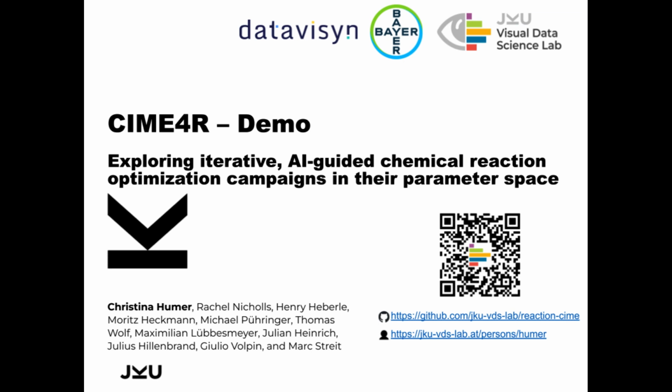This was a demo of how to use CIME4R and its features. The code is openly available on GitHub, and we also provide an extensive user documentation.